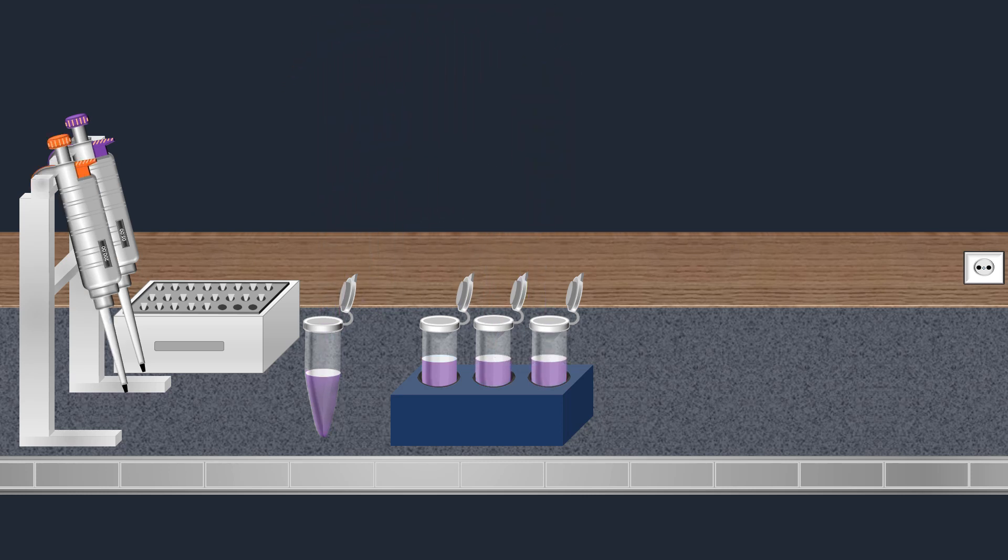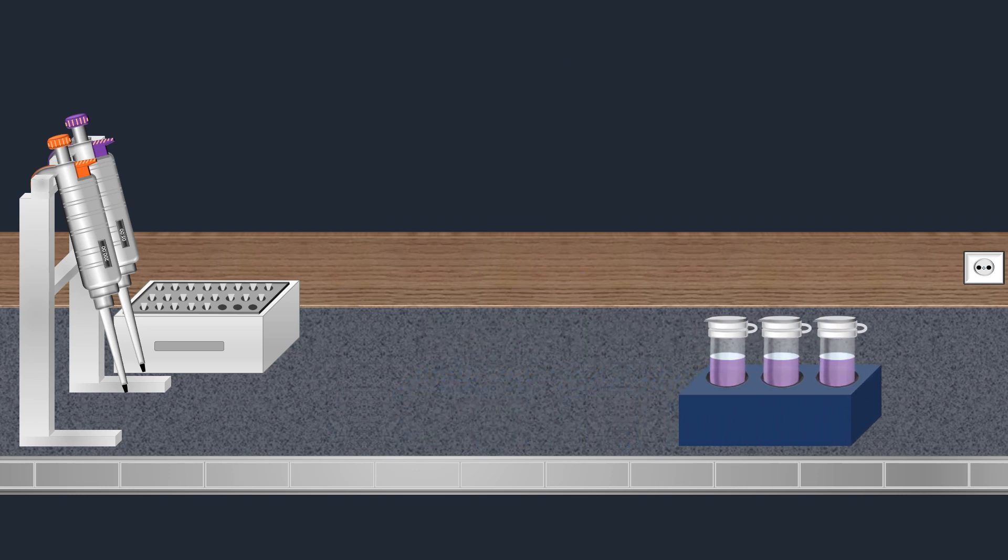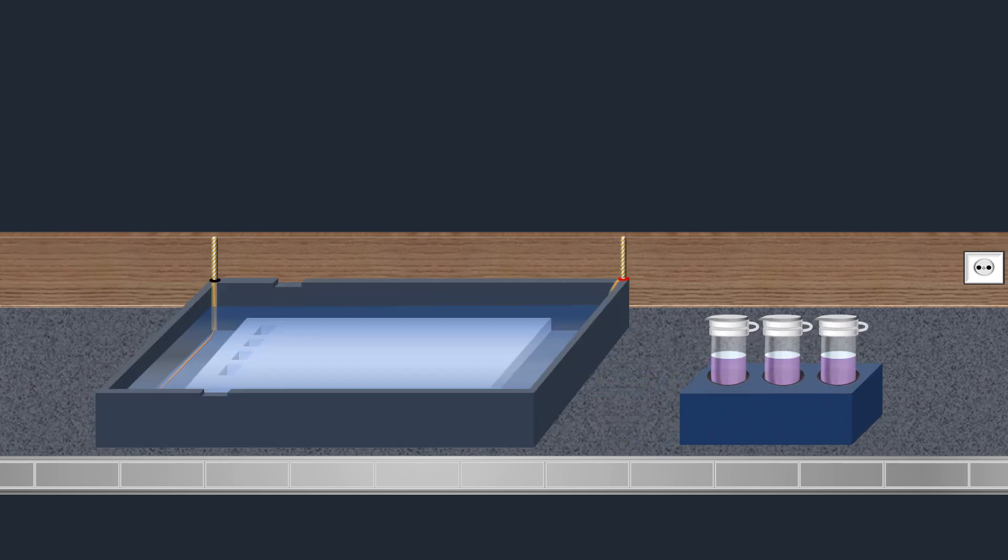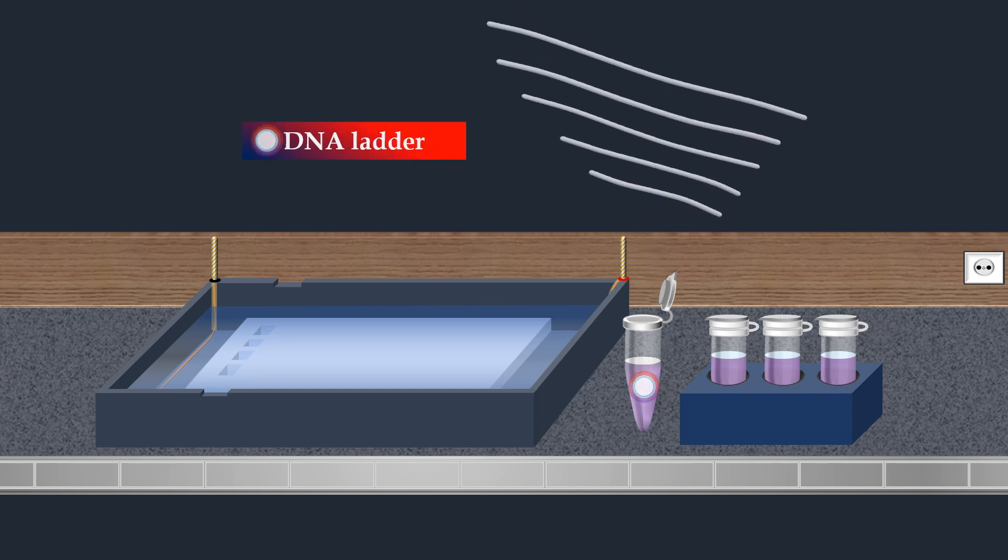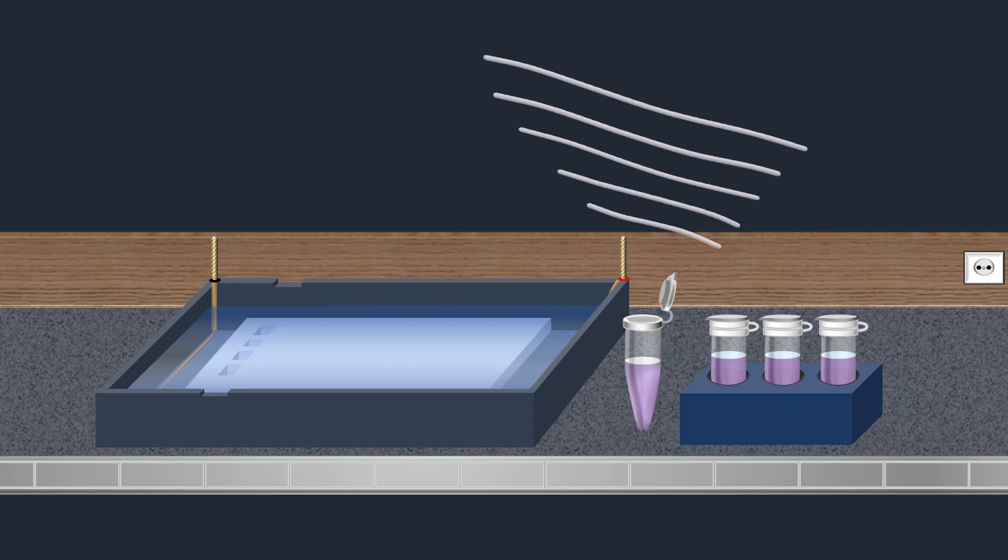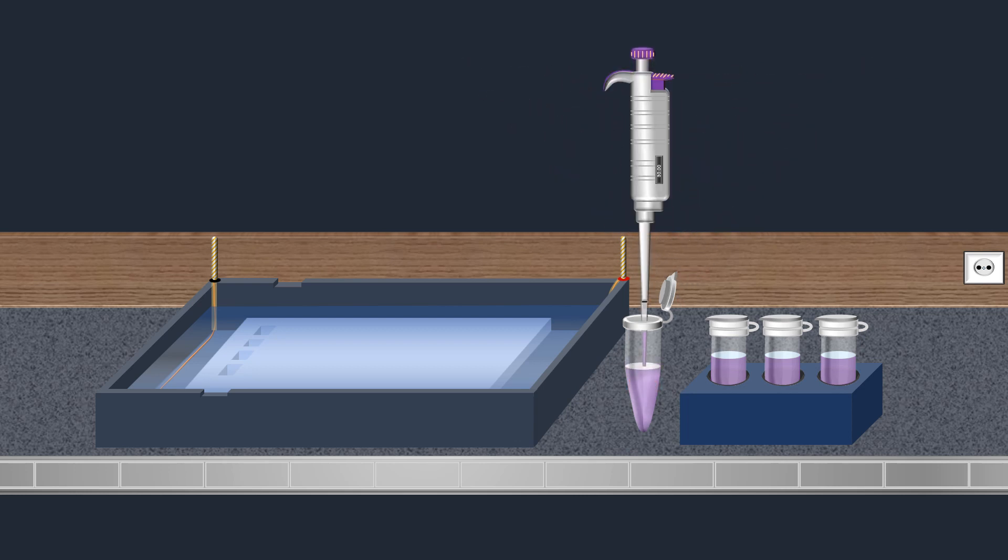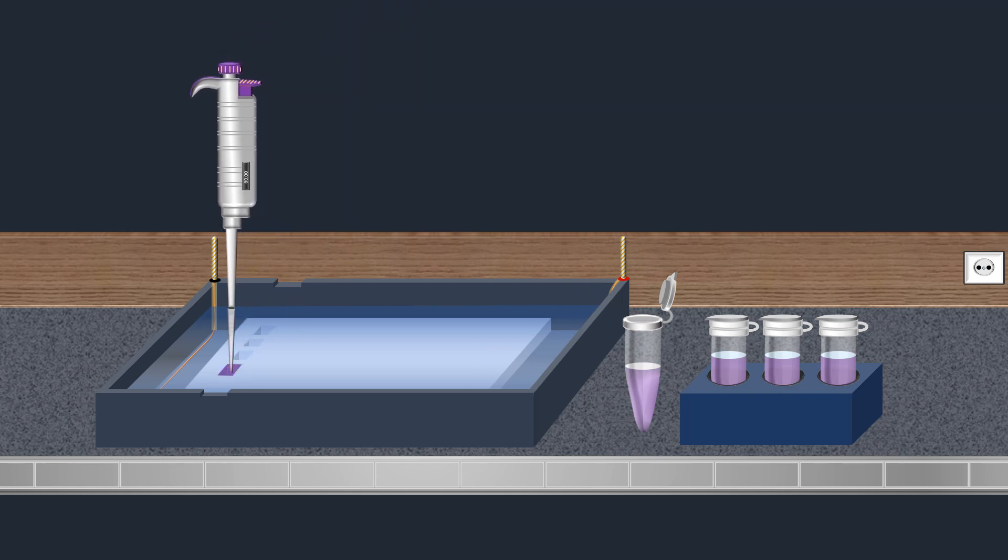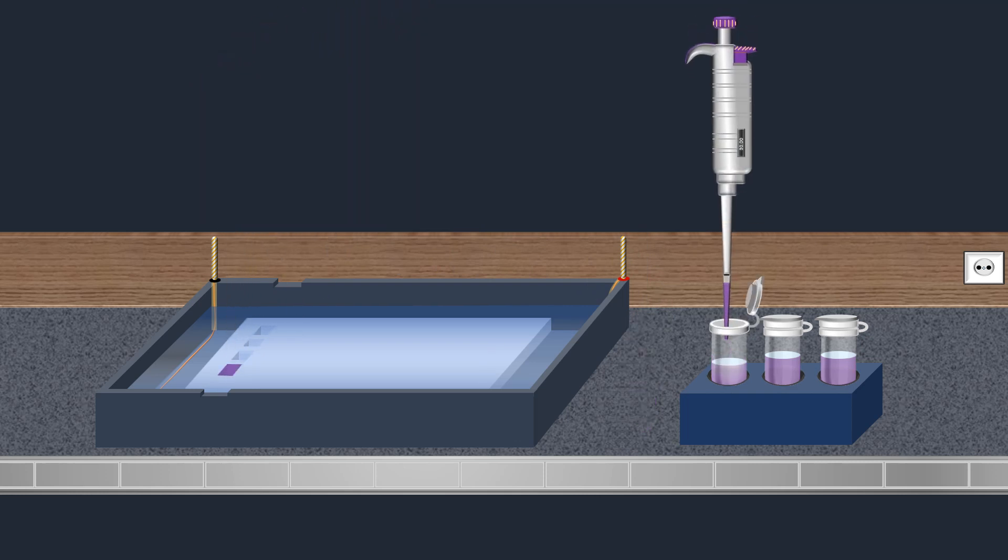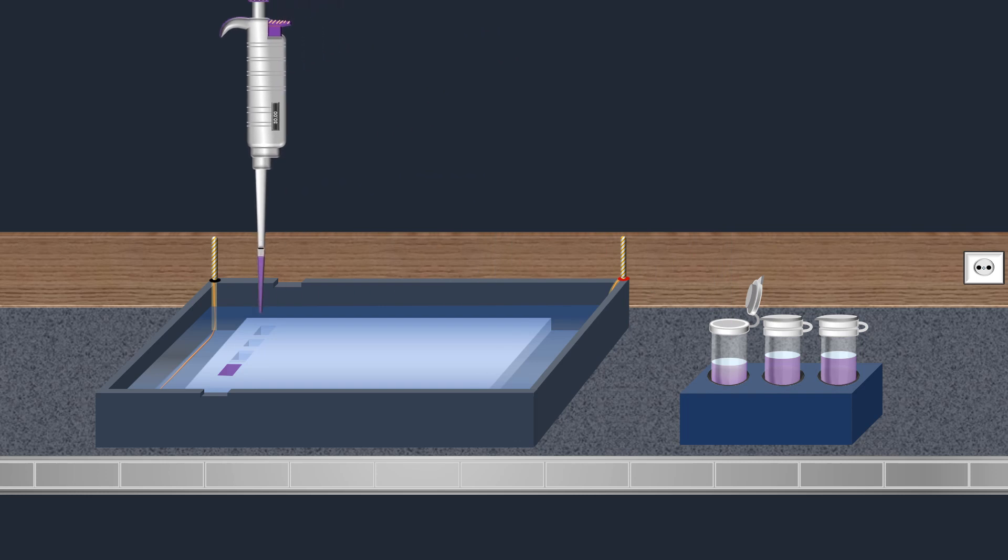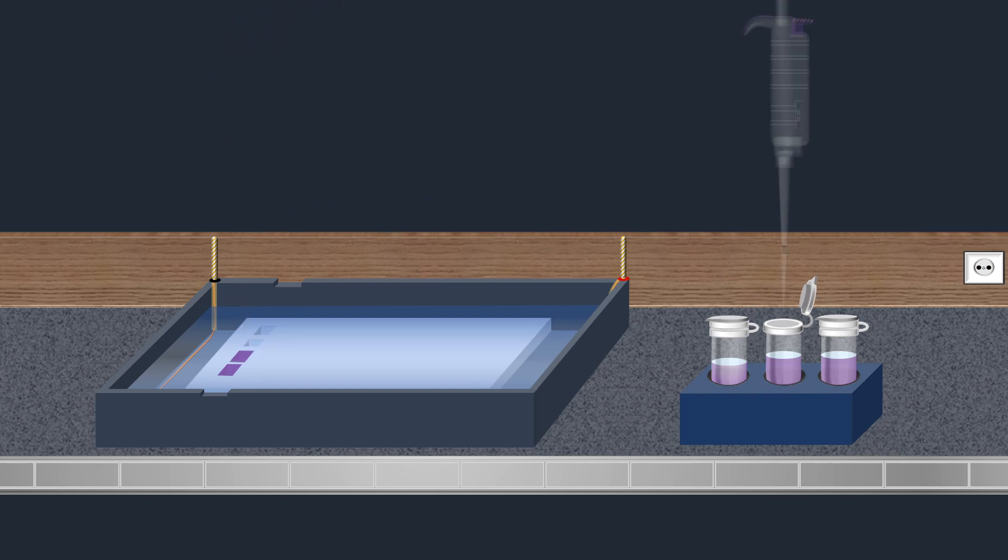Before loading the samples into the wells, a molecular weight size marker known as a DNA ladder is commonly used as a standard reference that contains DNA fragments of known lengths. It is loaded into the first well of the agarose gel. Once the molecular weight size marker has been loaded, the DNA samples are loaded into the wells.